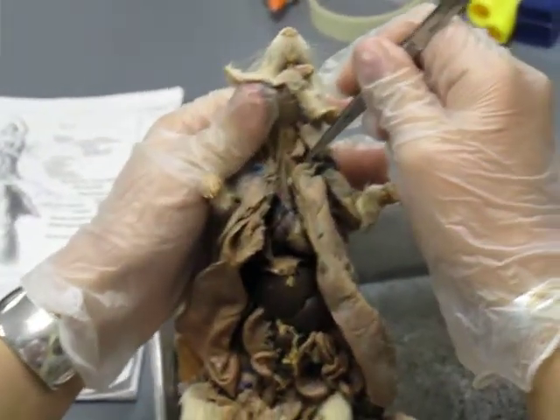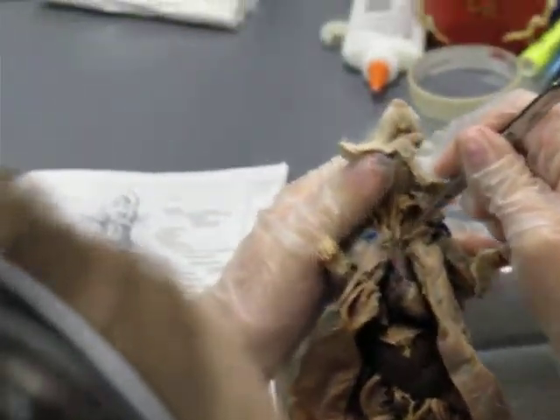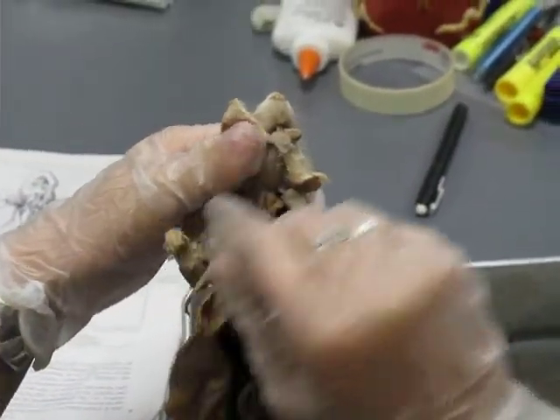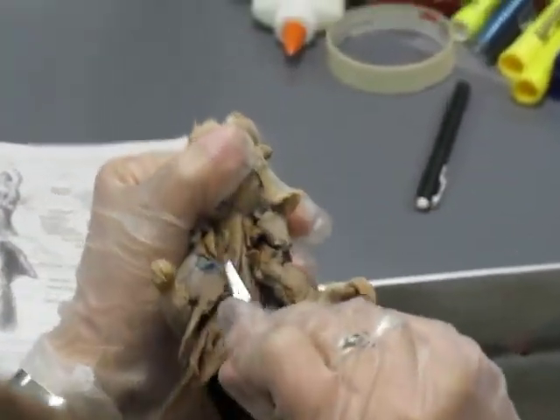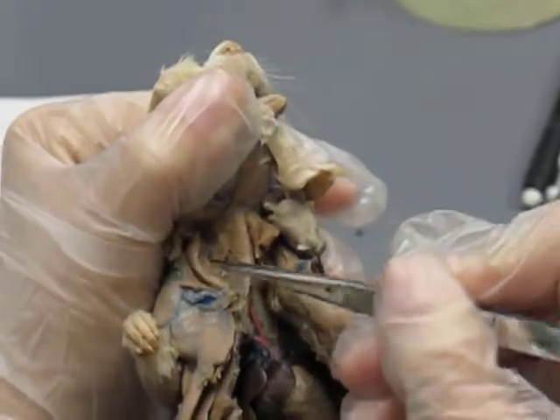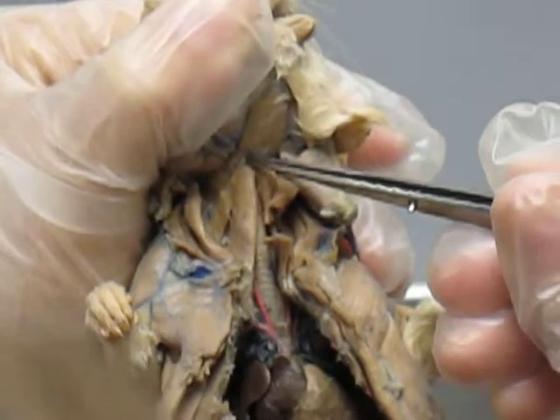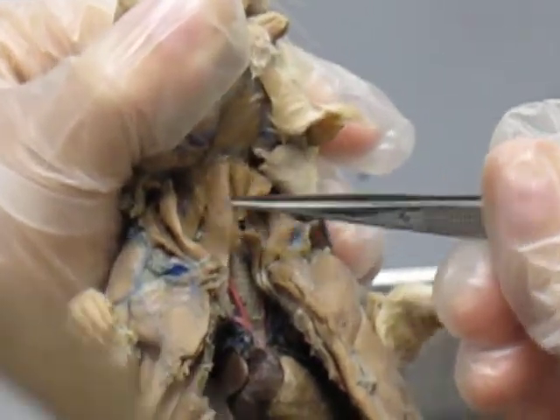You can either cut and reflect them back so that you can see things, or you can leave them in place and just kind of shove them over to the side. I'm going to show you guys the ones that are shoved over to the side. This is your sterno going to the hyoid bone, so sternohyoid — that was the one you saw last week.